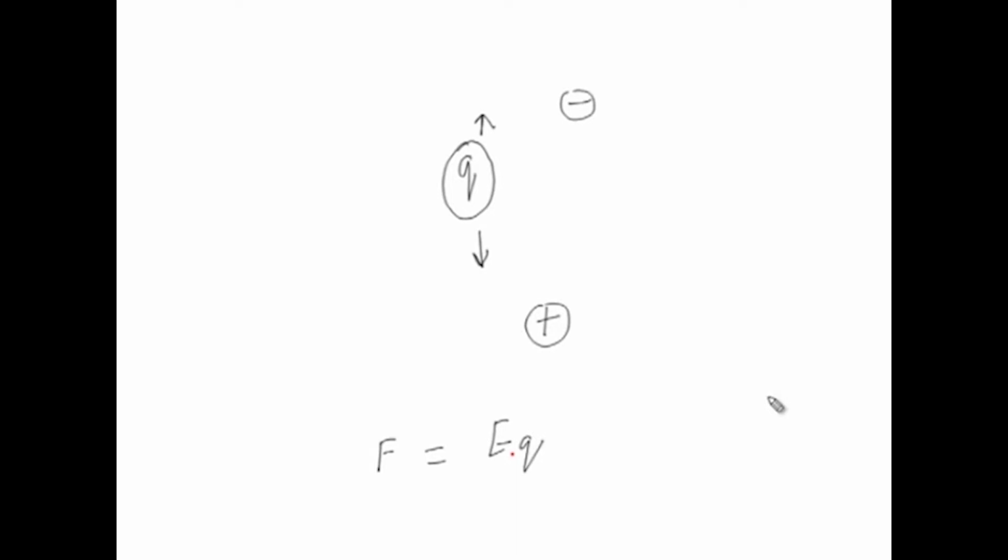Now, there is another force when a particle moves, like we were talking about size and shape: the frictional force. That frictional force opposes the motion of the particle as it moves through a particular medium. You can also call it a viscous drag, denoted as F.